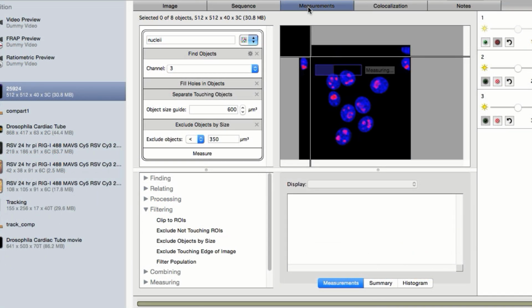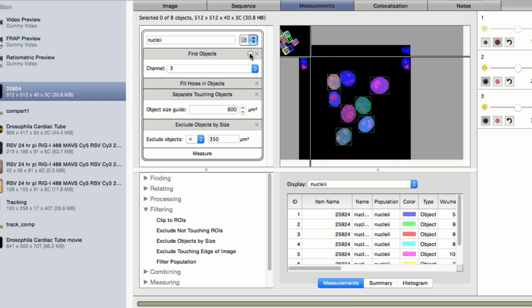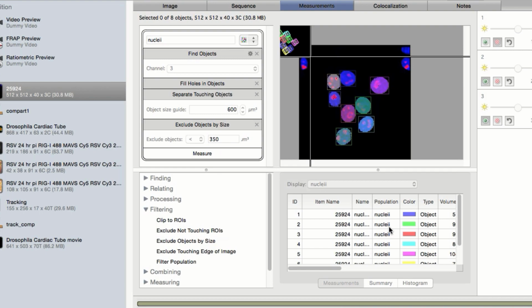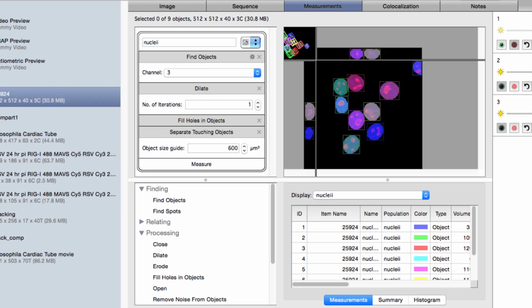In this protocol, there are a number of steps, but in all protocols, the first step is defined by intensity. Volocity has an automatic thresholding algorithm that utilizes Otsu's method to separate signal from background. An offset from the calculated threshold can be applied to further refine the objects identified. The threshold is recalculated for each time point, so automatic thresholding is ideally suited to multi-time point datasets or for batch processing.